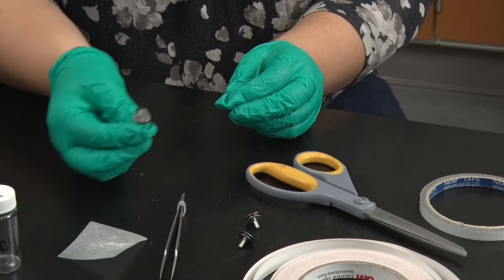Welcome to the SEM lab. This is the SEM that we will be using today. It can operate in three different modes: high vacuum, low vacuum, and environmental SEM mode. We will image in all three modes today.